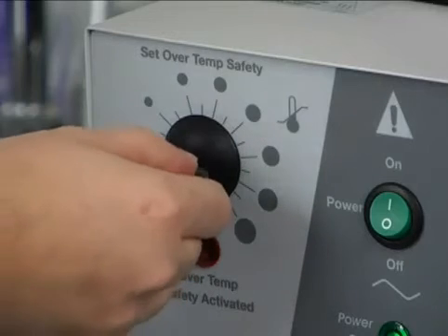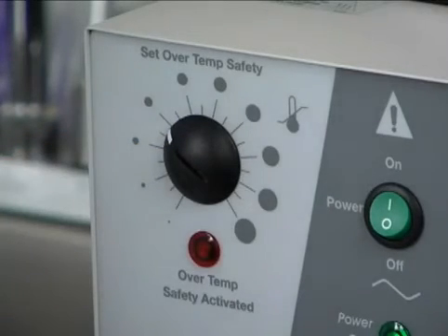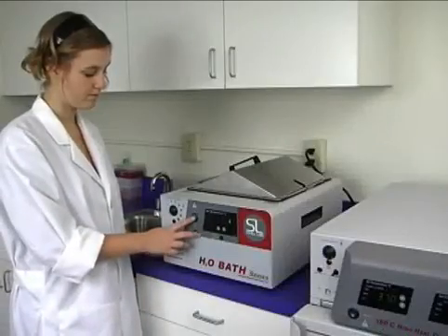Slowly turn the dial forward until you hear a soft click and the light stops blinking. This means the safety thermostat is set just above your operating set point.